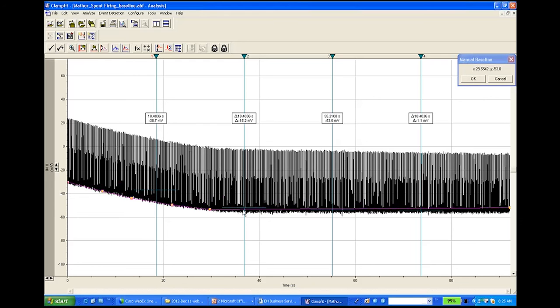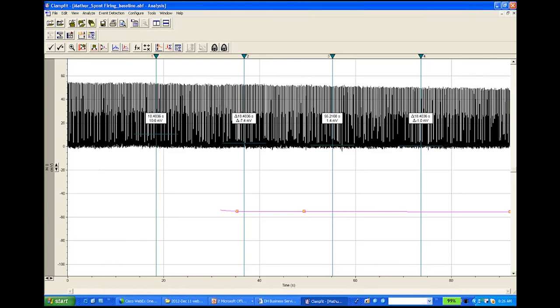Now you can add more. And you can add more here. Okay. I think it's pretty good right now. Of course, you can put in more points, which can give you a better result. So after this, I just hit OK. Now you can see the baseline is quite flat. Of course, you see the shift. The baseline right now is at 0.